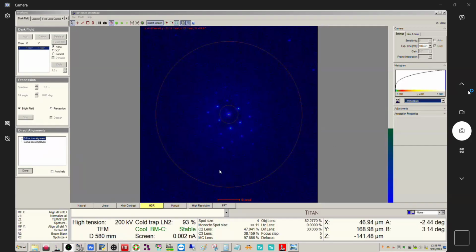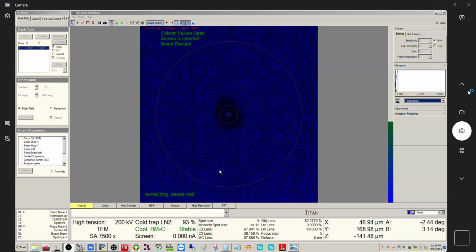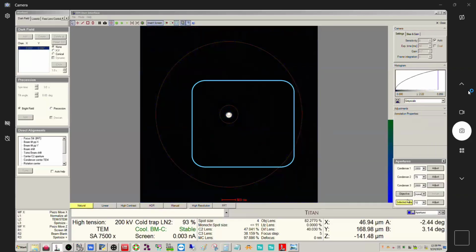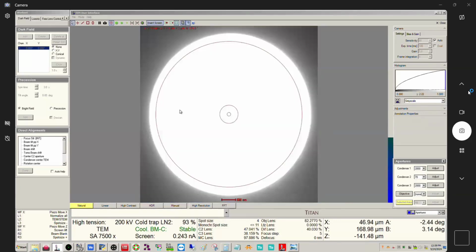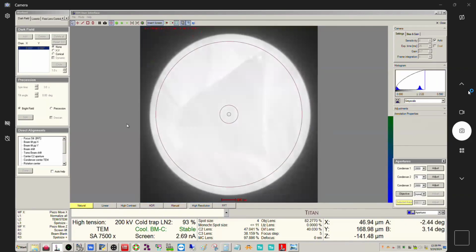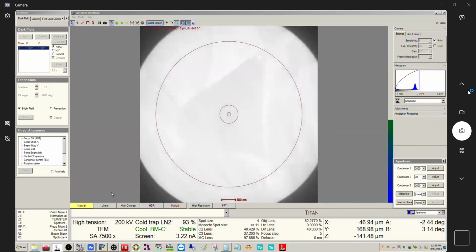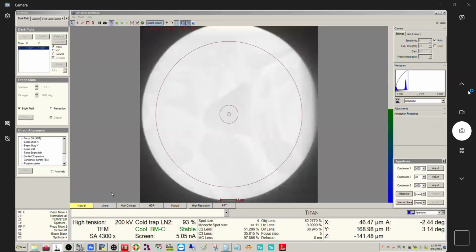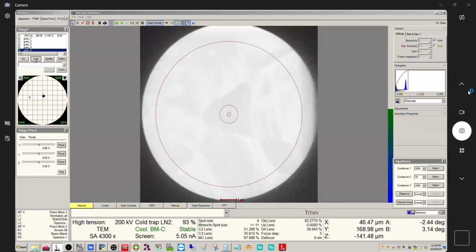So I'm going to turn off diffraction. I'm going to switch this to grayscale and take out my apertures panel, or selected area aperture. And there we go. I don't believe I took this grain, so I'm going to have to rename this here. But anyways, let's do another grain here so we can get some more sampling. Since I don't know where we're going, let me find my stage tab, and I'm just going to add this.